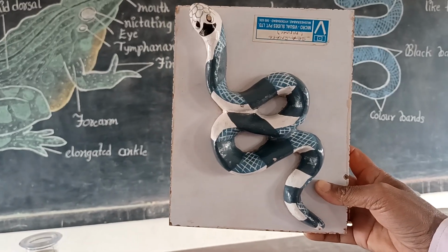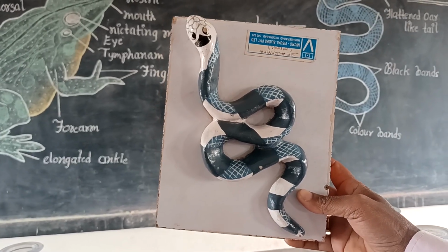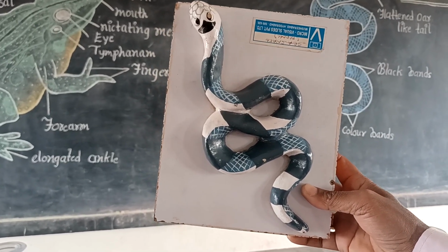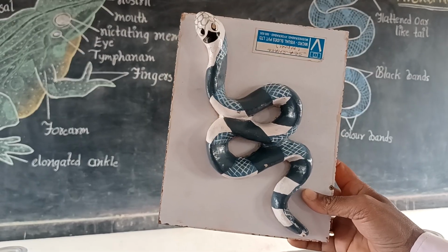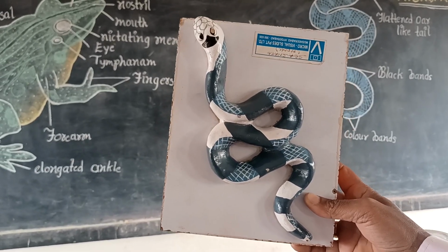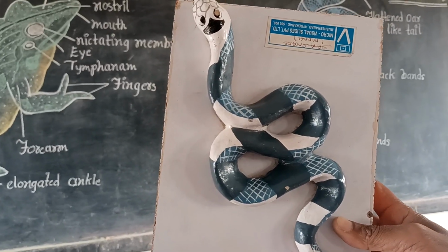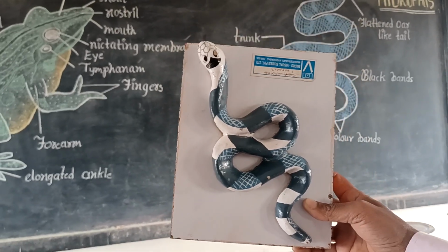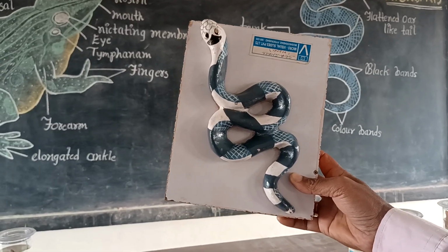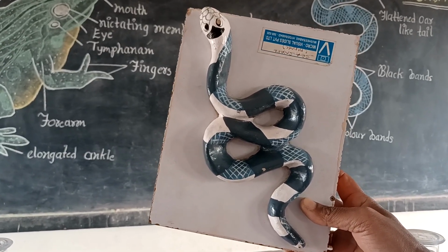This is the specimen of sea snake. It is commonly known as Hydrophis. The tail is flat and laterally compressed. It is oar-shaped and useful for swimming. The nostrils are on the top of the snout. They are valvular. The body is covered with small scales and has dark crossbands. Head and eyes are small.